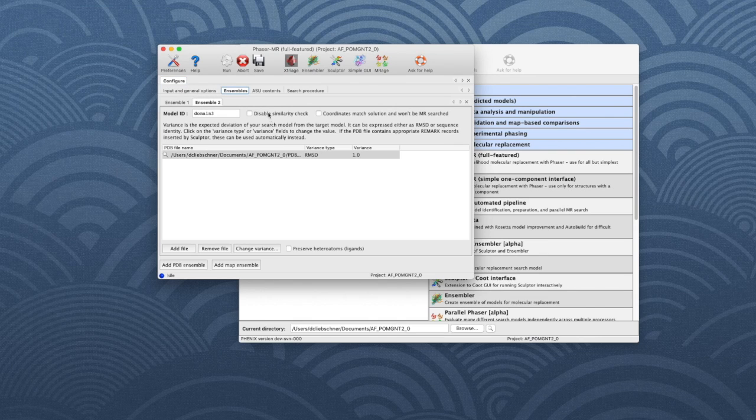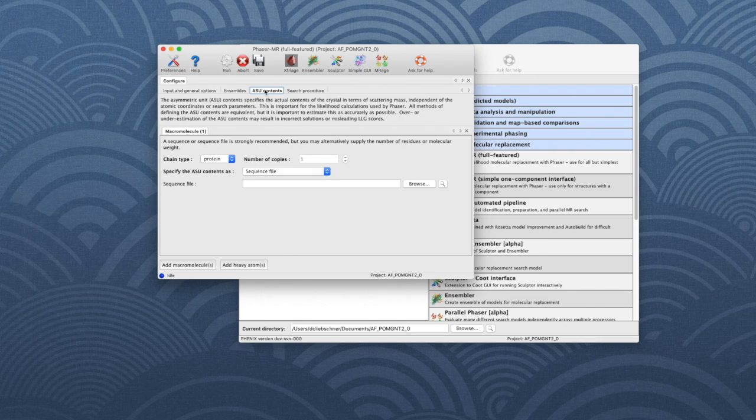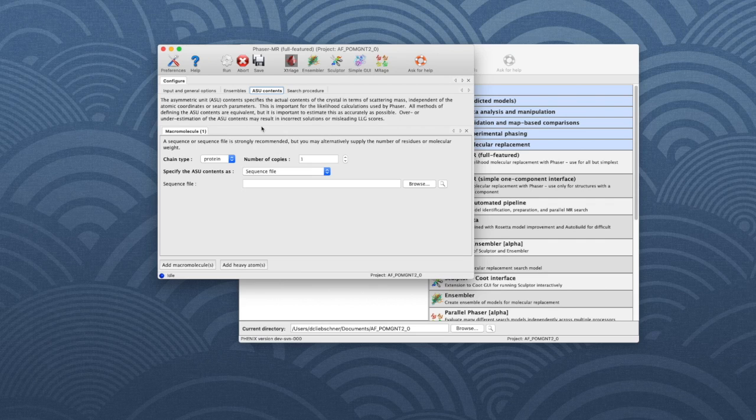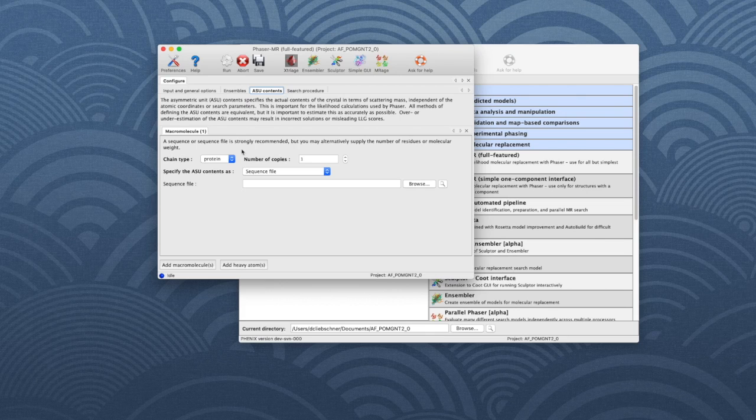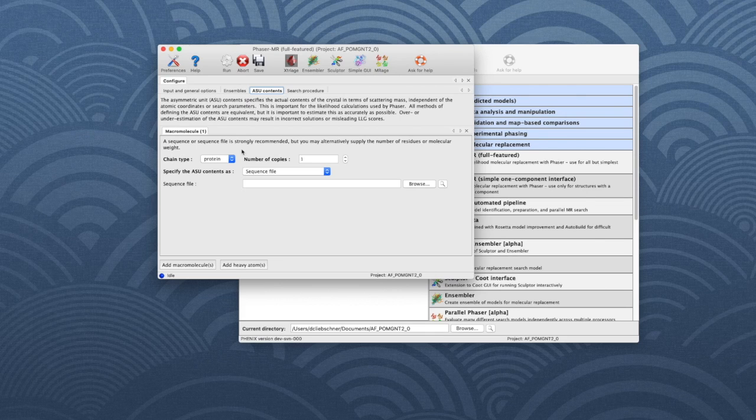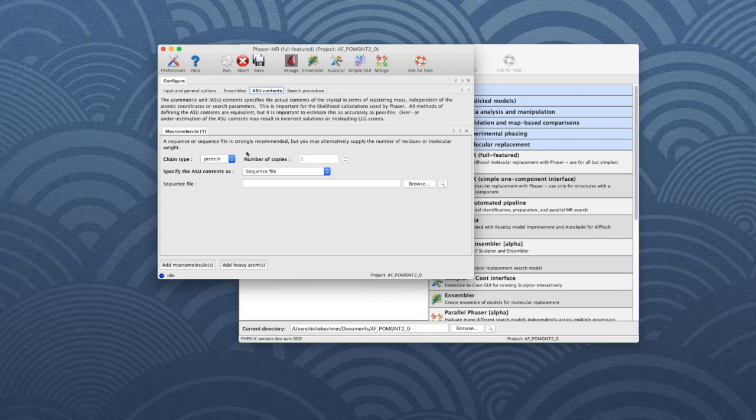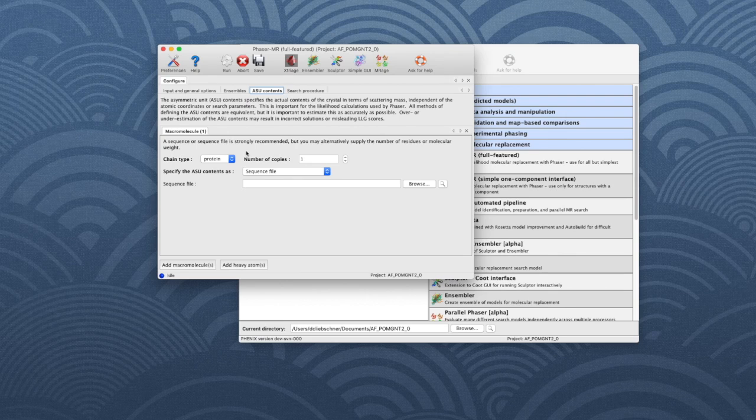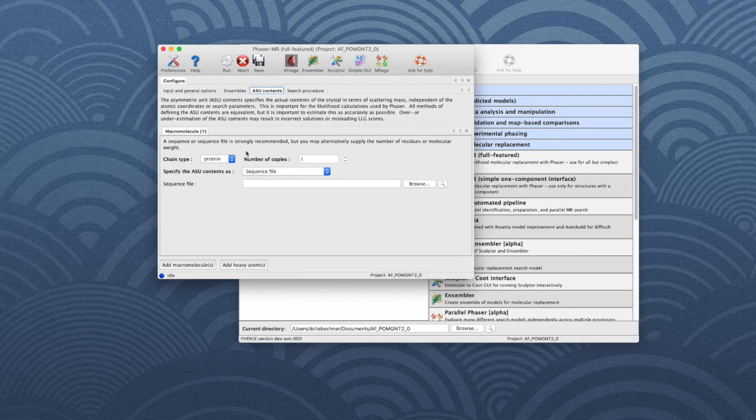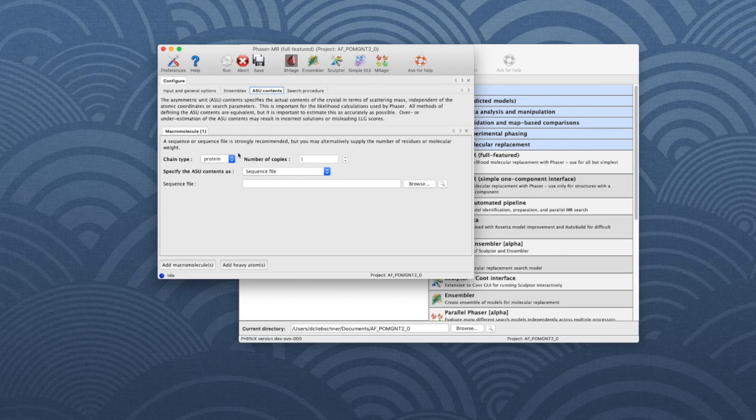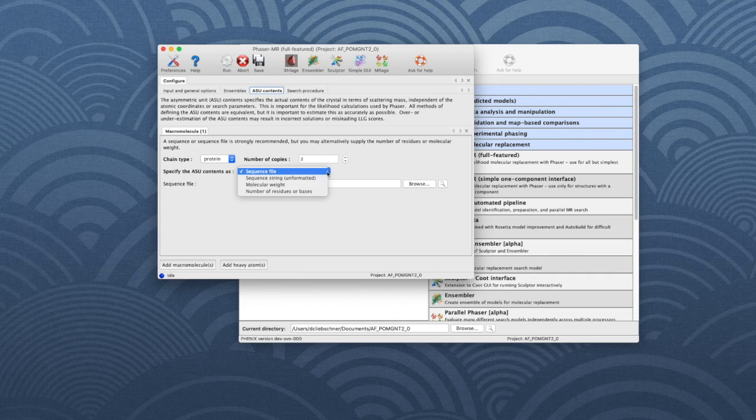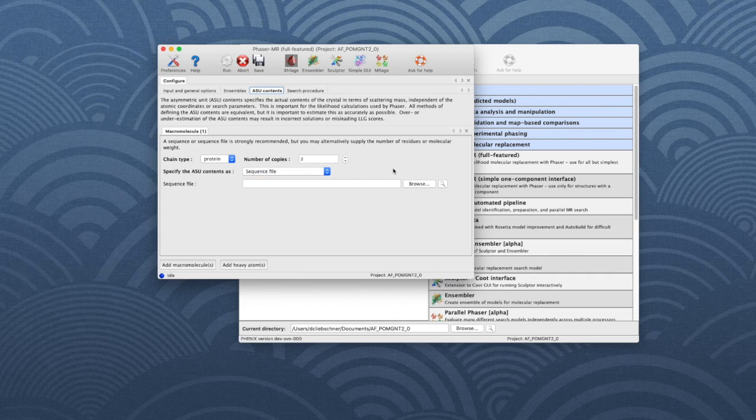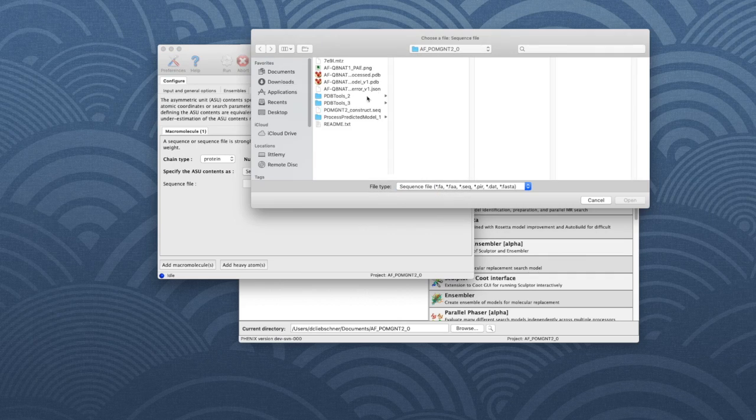Go to the ASU Contents tab. For each molecule in the asymmetric unit, we tell Phaser whether it is protein or nucleic acid and how many copies exist. The size of each component can be specified in a number of ways, but it is usually most convenient to use the sequence of the protein you crystallized. Make sure the chain type is set to protein. Change the number of copies to two, specify the ASU Contents as sequence file and select the file with the sequence of the construct.